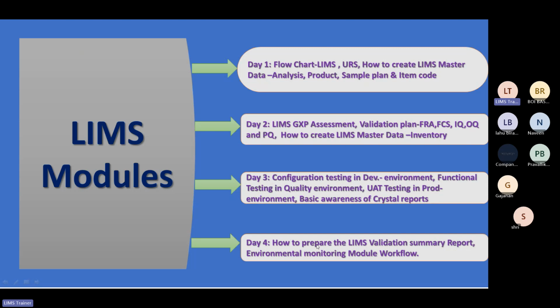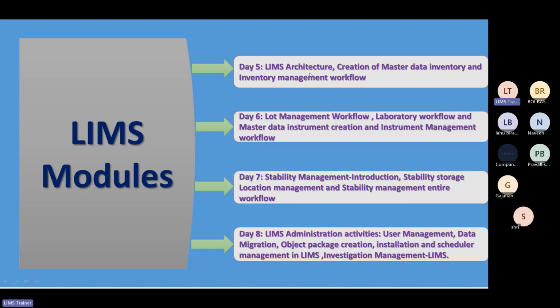Okay, then comes how to prepare the validation summary. Then the environment monitoring module, how the workflow is, that also will be explained. Okay, then the architecture. Okay, then creation of master data inventory, then lot management workflow. All the workflows will be included. Okay, then laboratory workflow, master data, instrument creation. Okay, then stability management will be there. Okay, and also some administration activities.